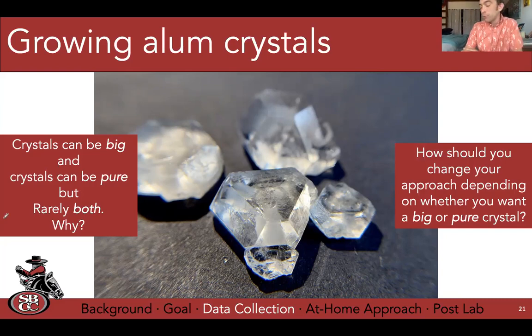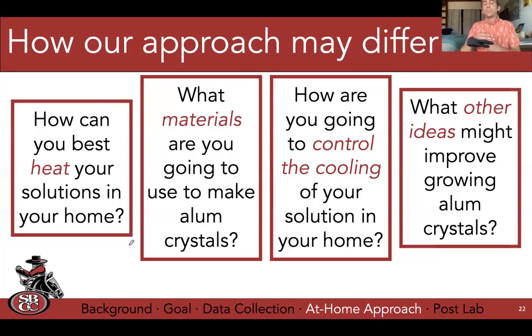What about a pure crystal? Why do you think the trick is for growing a pure crystal? Just like slow and steady. Slow and steady, although I will tell you that if you go too slow, and you keep the solution too hot too long, you can actually melt your seed crystal and then nothing grows. So if you see, when you come back to your seed crystal, if you just see a loop, it means that you cooled too slowly and you didn't get it. At some point, you have to have a driving force going from liquid to solid for a crystal to grow.